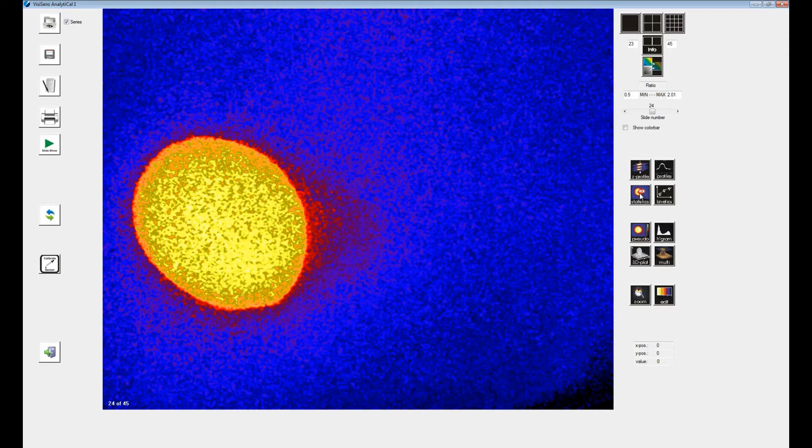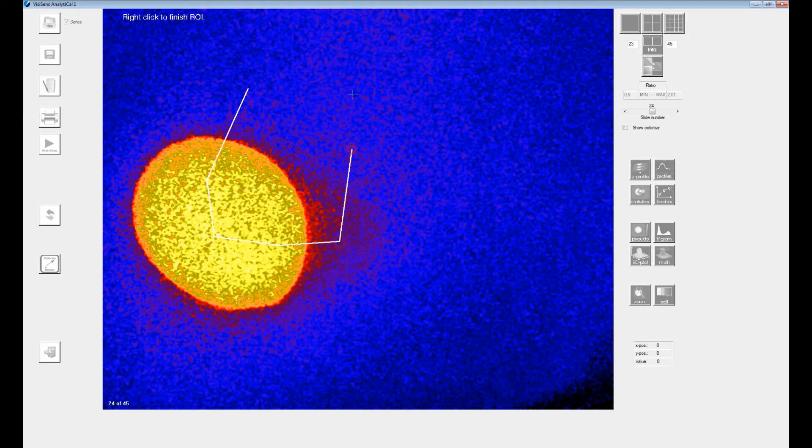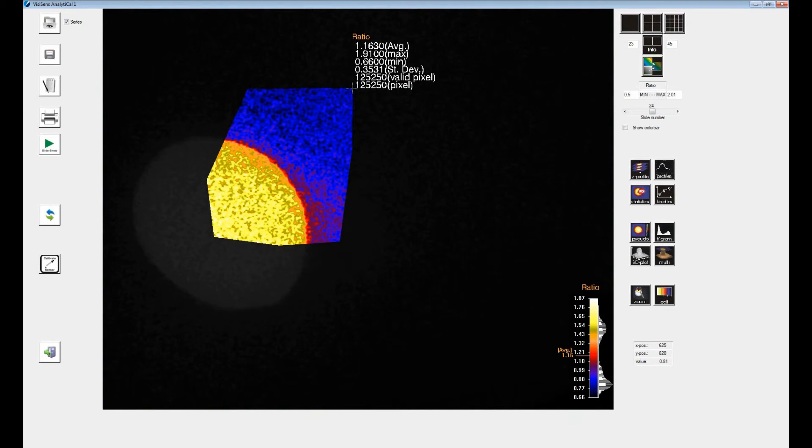The function ROI statistics will calculate and show statistical values for the selected region of interest. Statistical information is shown next to the ROI and also displayed in a color bar at the lower right screen.